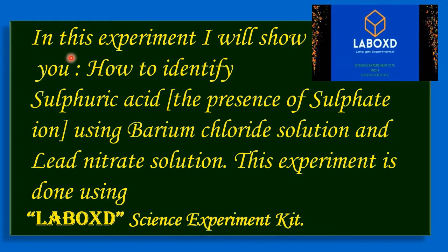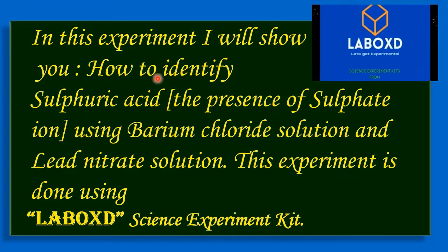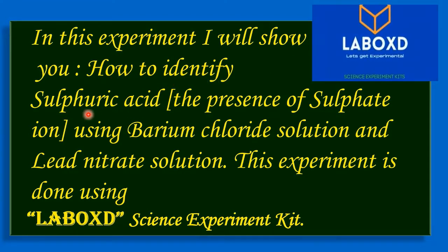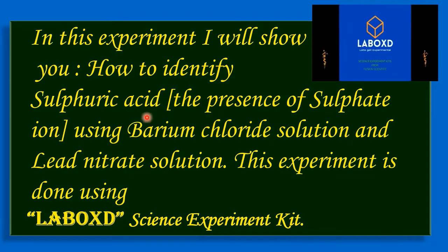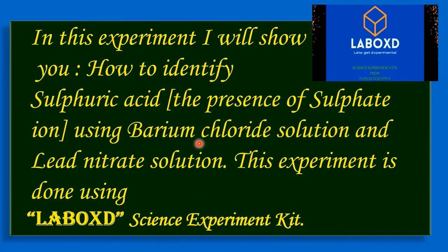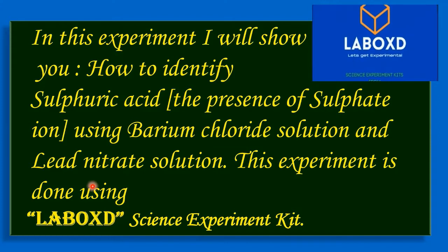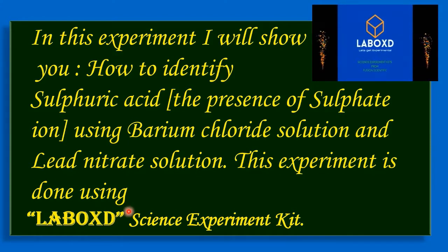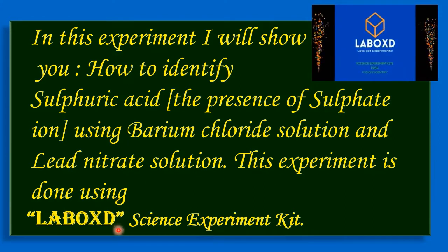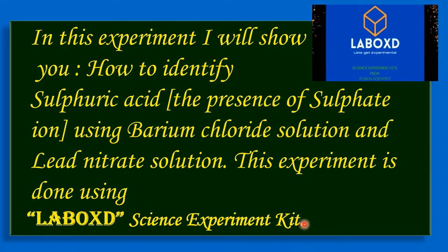In this experiment, I will show you how to identify sulfuric acid — the presence of sulfate ion — using barium chloride solution and lead nitrate solution. This experiment is done using the Labox-D science experiment kit.